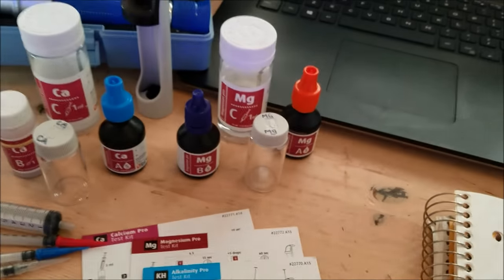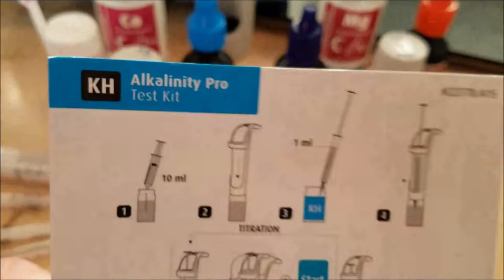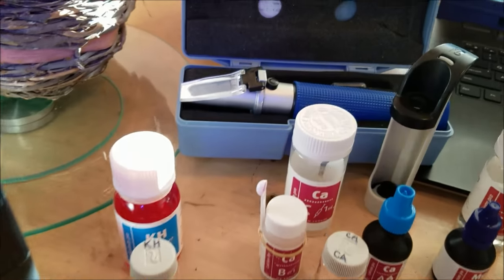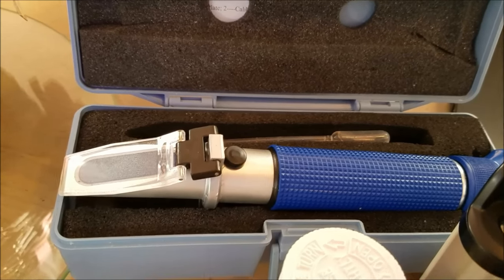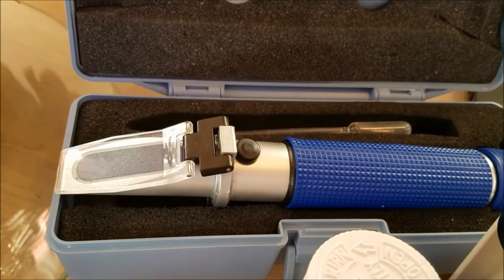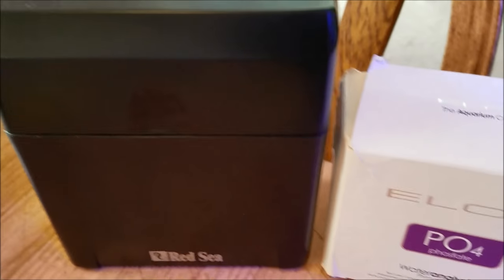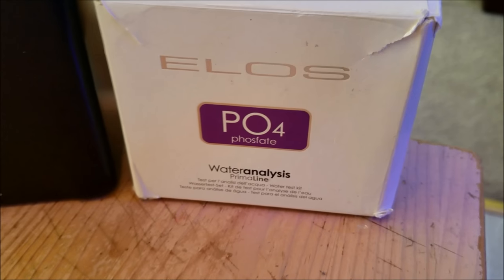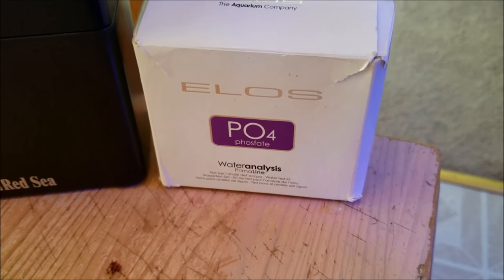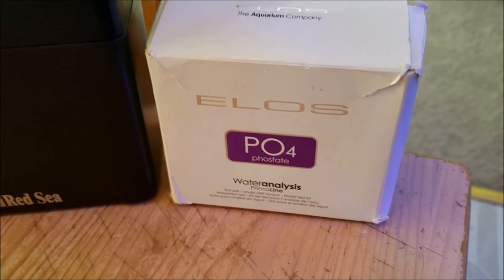You get three handy laminated cards — what I really like is that they're laminated, so they can get wet, you just wipe them off, and they'll dry up without a smudge. I also use a refractometer. In my opinion, there's no other way to check salinity — this is the most accurate. I also use the Red Sea Nitrate Test Kit and the ELOS Phosphate Test Kit. The reason I use ELOS is that it tests for both organic and inorganic phosphate, so I get the most accurate reading possible.